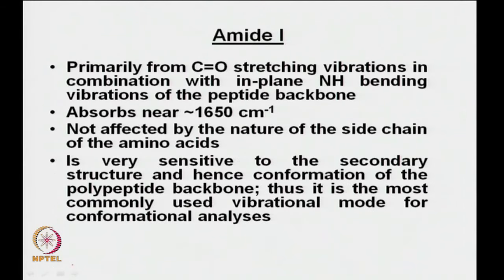However, this is a very important point, the last point is very important. Why is it important? See what it says. These stretching vibrations are very sensitive to the secondary structure and hence conformation of the polypeptide backbone. Thus, it is the most commonly used vibrational mode for conformation analysis.